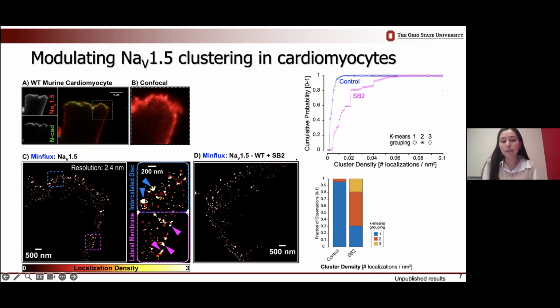Because this is a relatively new technique, it hasn't been tested in a lot of biological systems, so we undertook the challenge of trying to image optically dense samples such as cardiac cells. As you can see in panels A and B, we have a typical confocal image where we are able to fluorescently tag sodium channels and visualize them. With this, we're able to confirm the presence of these proteins within the cardiac cells, but we're not able to get exact measurements of sodium channel densities, and we don't really get to see what these clusters look like.